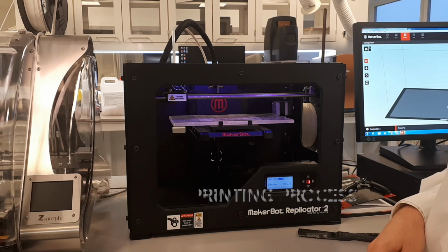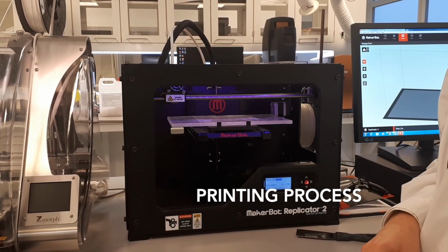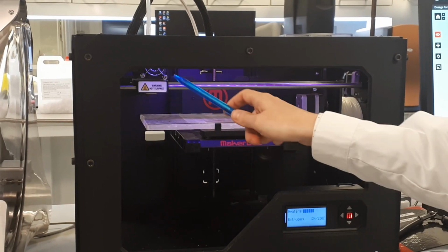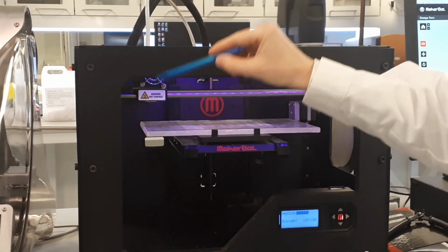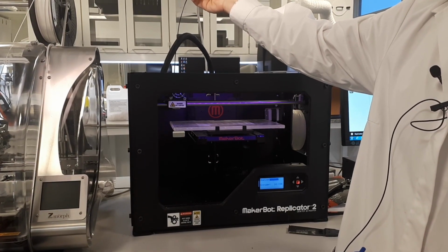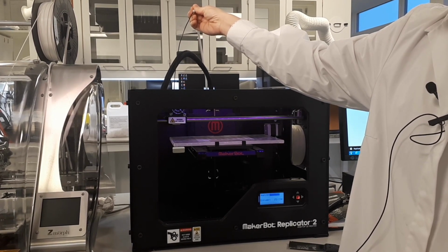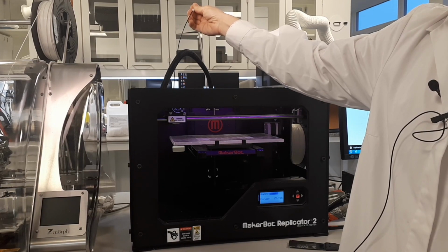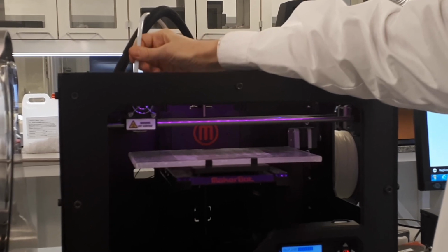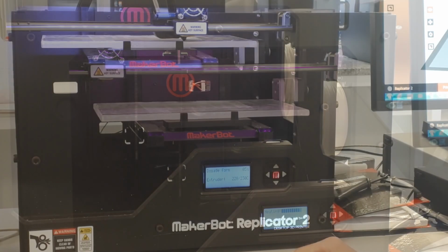Now the printer is warming up to reach the temperature of 230 that we put in our parameters when we modified the settings. So here is actually the liquefier that is warming up, and the filament is supplied with the rollers. So here is the filament. Currently it is a black colored PLA filament. PLA means polylactic acid. This is the most commonly used material in fused deposition modeling. Once the temperature reaches 230, it will start printing.